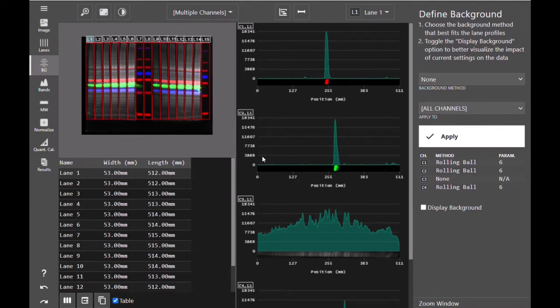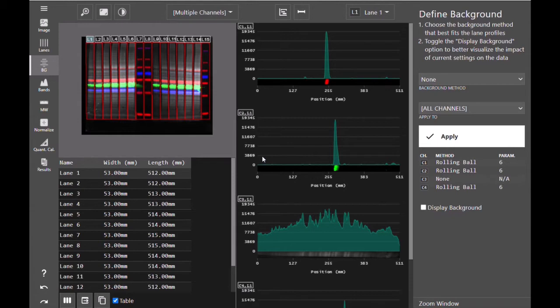So if you normally use rolling ball or rubber band to subtract background from your western blots, you may want to consider subtracting no background from the channel containing your total protein stain. Otherwise, Constant Value and Image Rectangle are great options for subtracting background globally across your entire blot without removing the majority of your total protein signal.